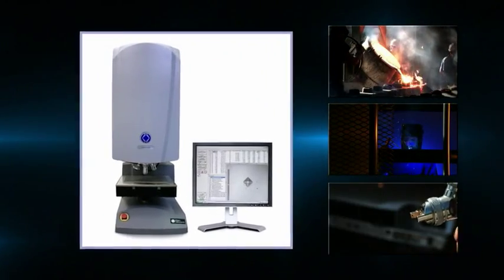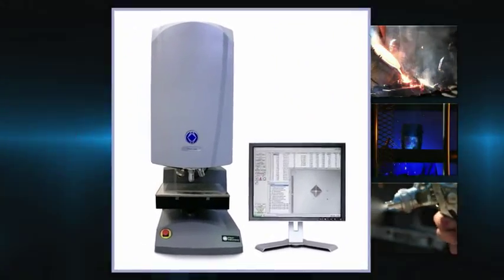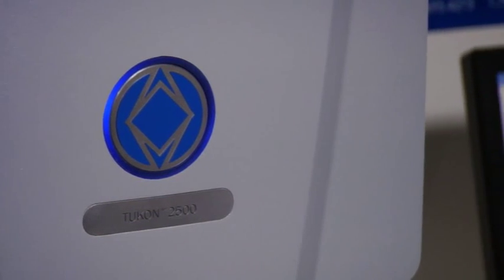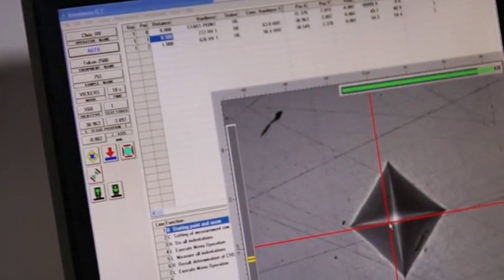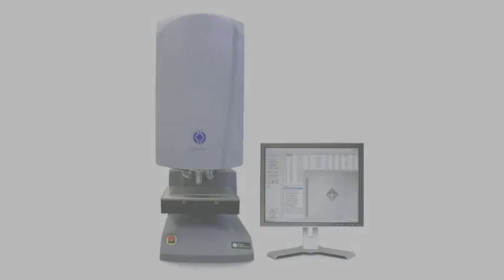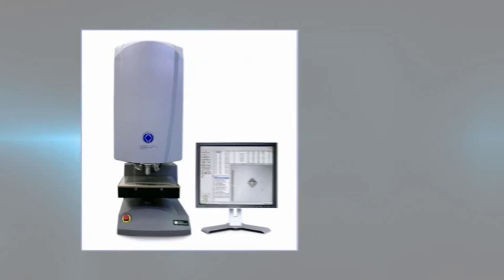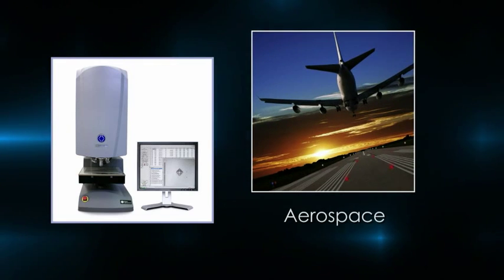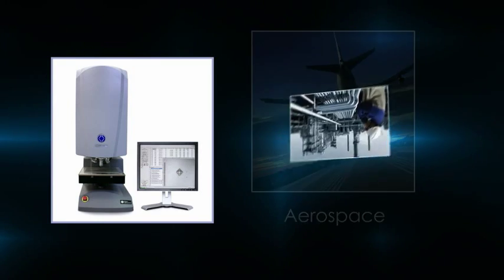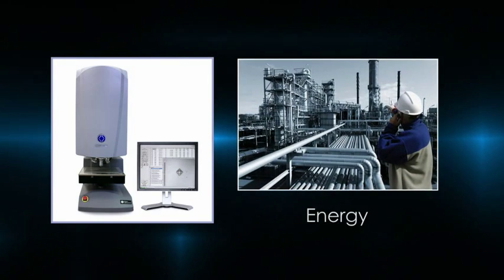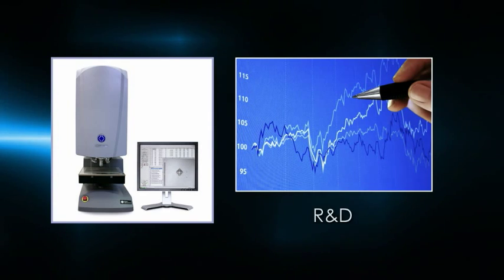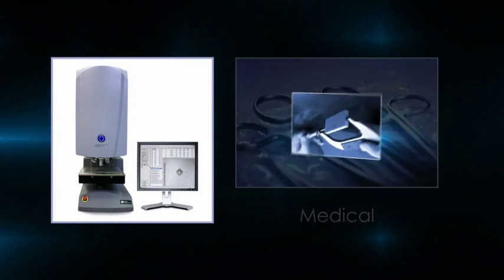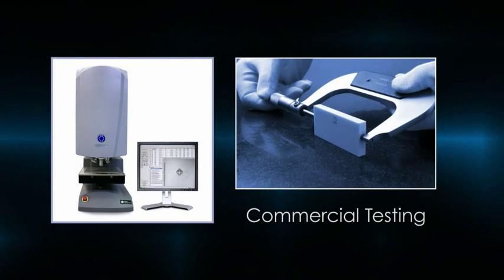The Toucan 2500 is the leading automated micro-macro Knoop Vickers hardness tester. Coupled with the Minuteman software, this automated solution is designed to meet the most demanding applications. Wilson has installed systems around the globe in many different industries, including automotive, aerospace, energy, R&D, as well as medical device companies and commercial testing labs.